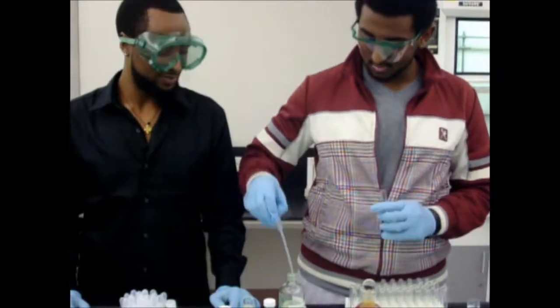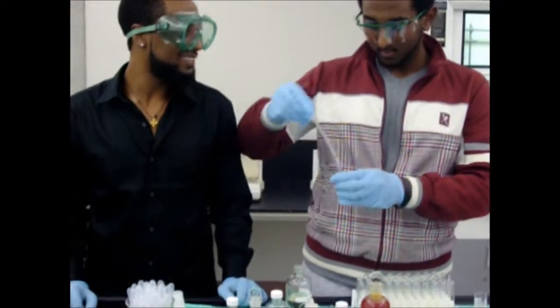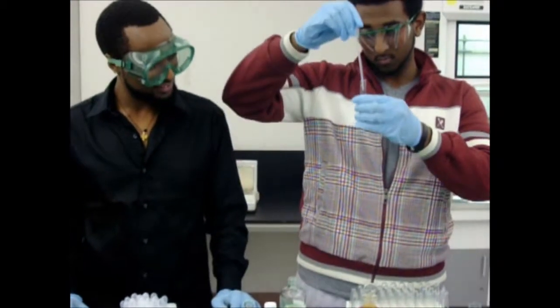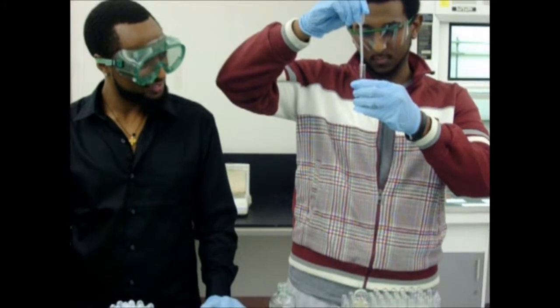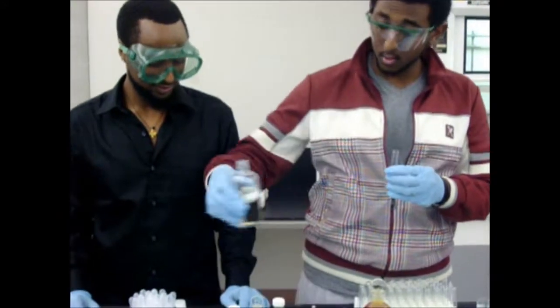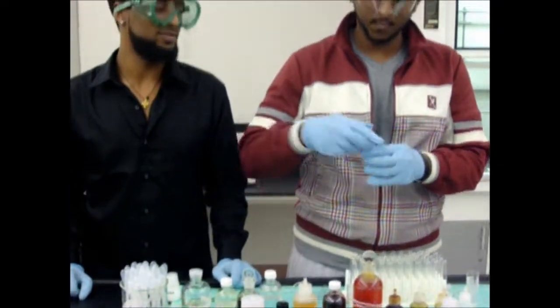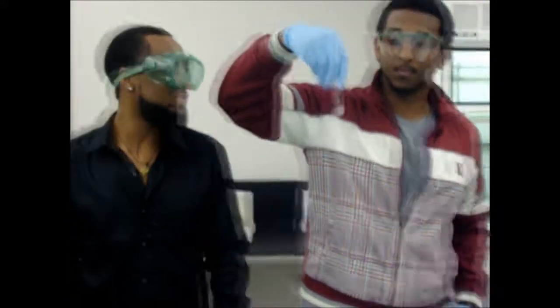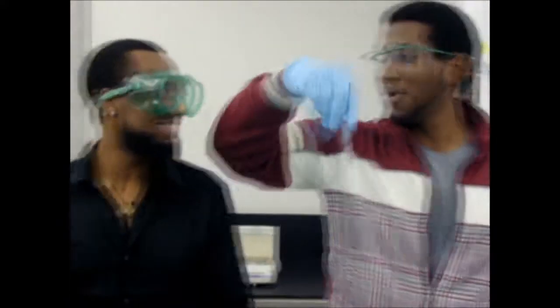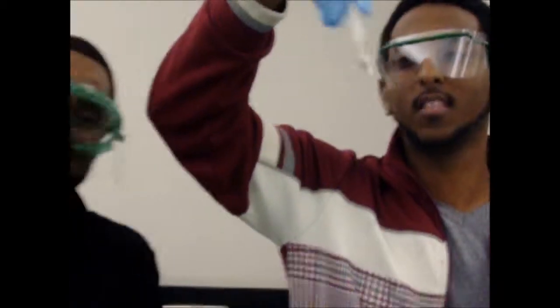My pipette. That's what it's called. Alrighty. So I dropped our Lucas reagent inside of our Lidocaine. Give it a swirl. Make sure you swirl it good. No problem, partner. Alrighty. Swirl it. I don't think you swirled it good. Swirl it better.